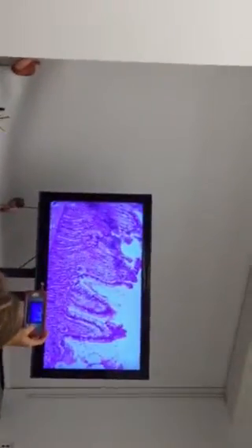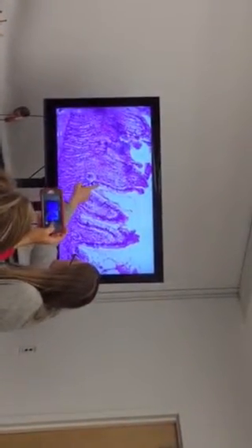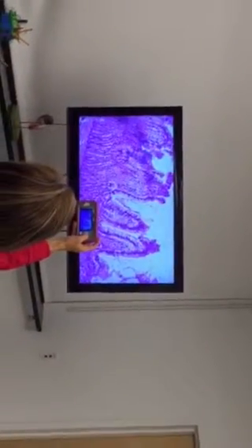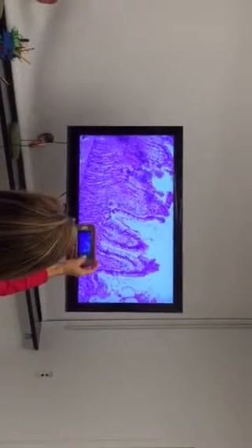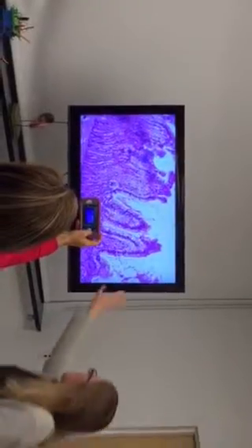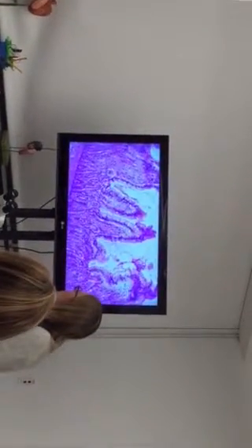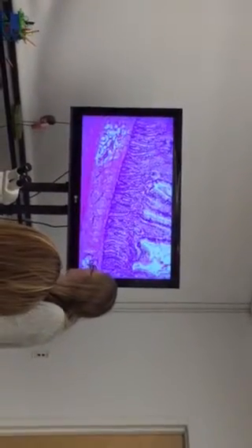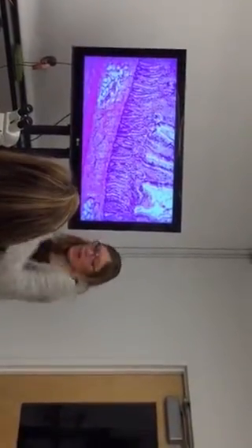Okay? If you look closely, we can see them better in the next magnification. But there's the goblet cells, the white spaces. They're releasing mucus for binding of the food again, lubrication. So those are all the villi. And there's some tears that happen when we make the slide, but you'll see the villi, right, the waves of the mucosa. Okay, now it's really hard to see the muscularis mucosae, so it's right in this area, but I don't have that on the list.